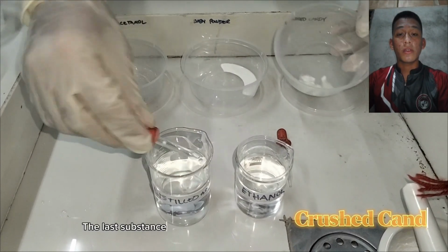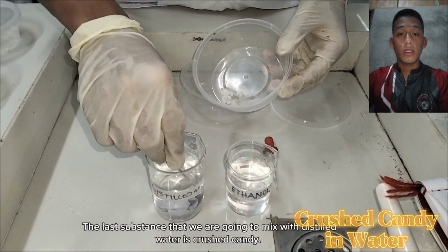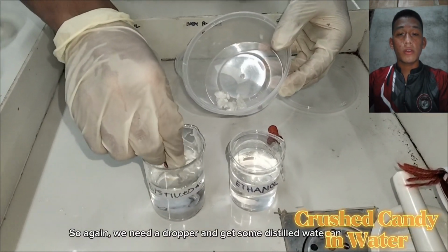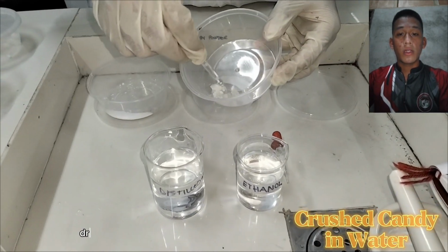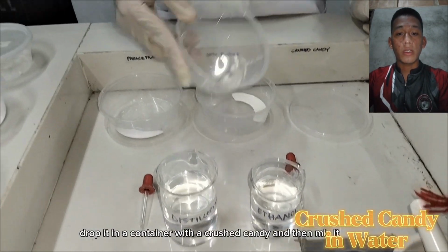The last substance that we are going to mix with distilled water is a crushed candy. So again, we need a dropper and get some distilled water and drop it in a container with a crushed candy and then mix it.